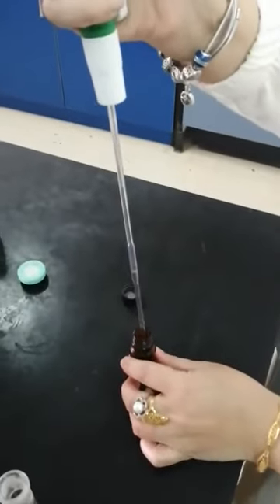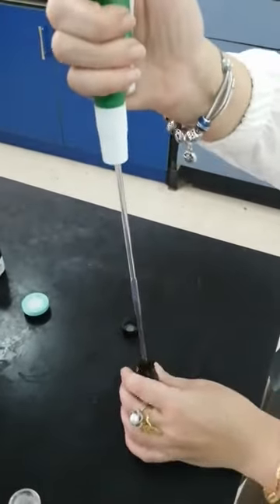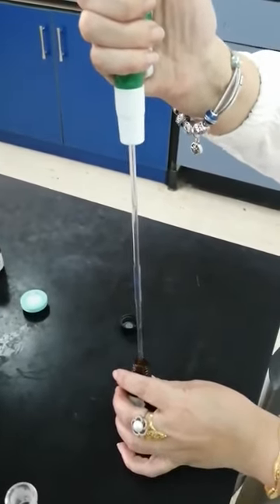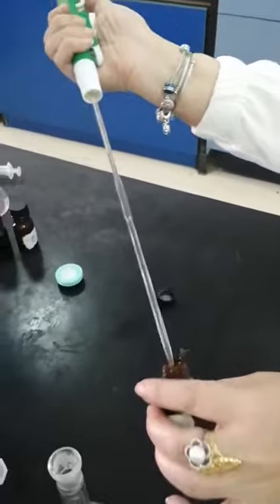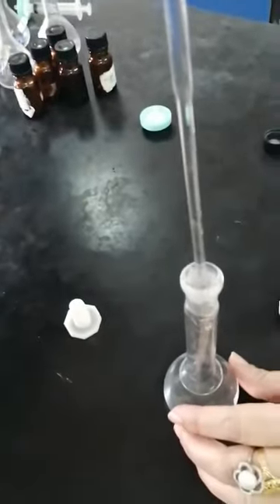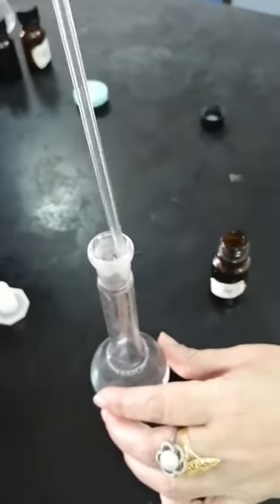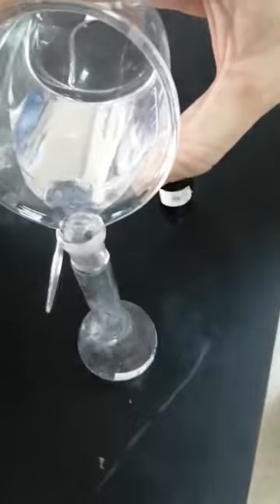It will be diluted 50 times, then I will complete the volume to 50 using the cold phosphate buffer.